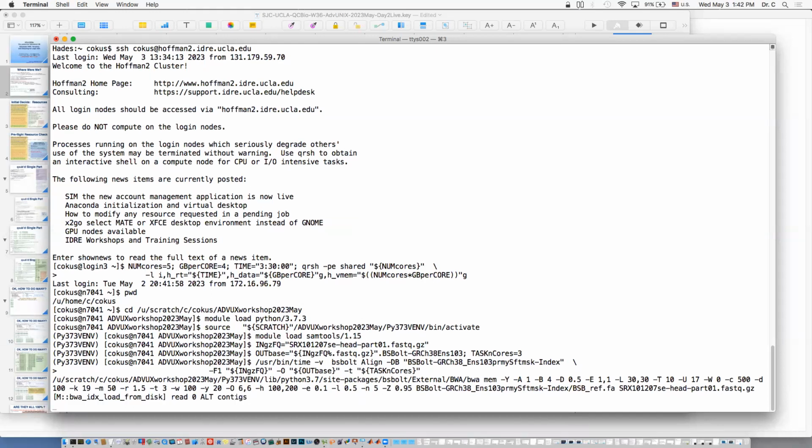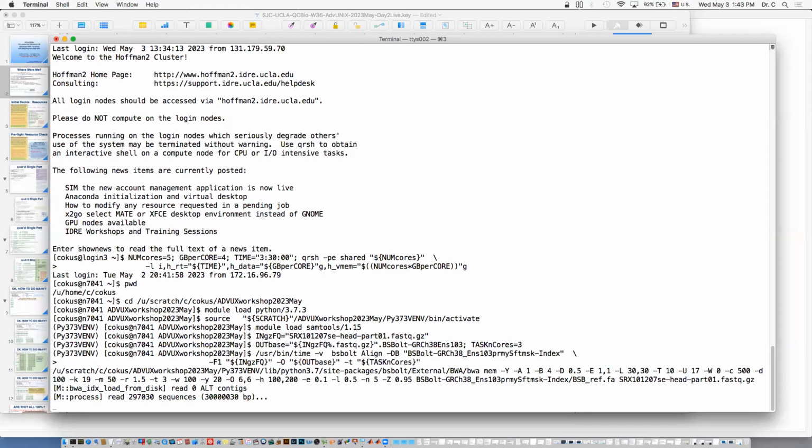So now I think we're basically done reading the reference genome. Or maybe that was just the plus strand and now it's working on the minus strand or something. Or bisulfite, there's actually 4 strands. There's the bisulfite converted plus, the bisulfite converted minus, the reverse complement bisulfite converted plus, and the reverse complement bisulfite converted minus, because bisulfite treatment changes C's to T's, which breaks base pairing. And so when you redo strands after that, either because of the way library prep works or whatever.